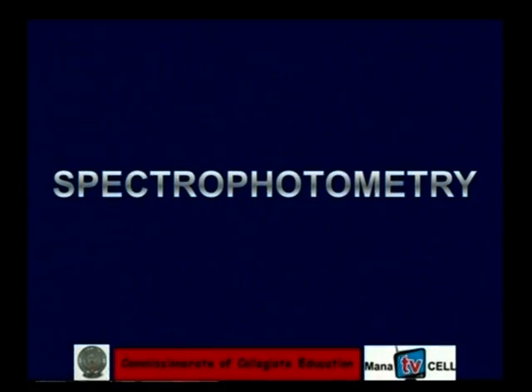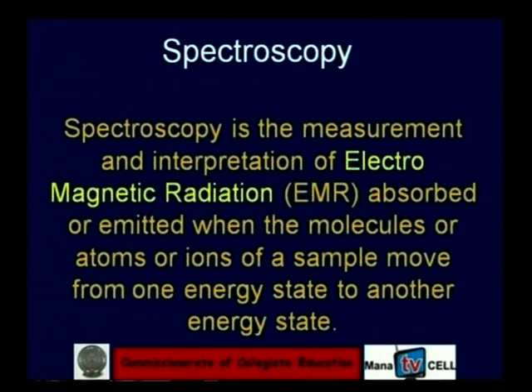Today I would like to deal with an instrument, that is spectroscopy or spectrophotometer. Before going to my topic, I would like to explain what spectroscopy or spectrophotometry is. It is the study of the interaction of light with matter. Suppose you imagine two samples of the same substance, the darker one is more concentrated than the lighter one.